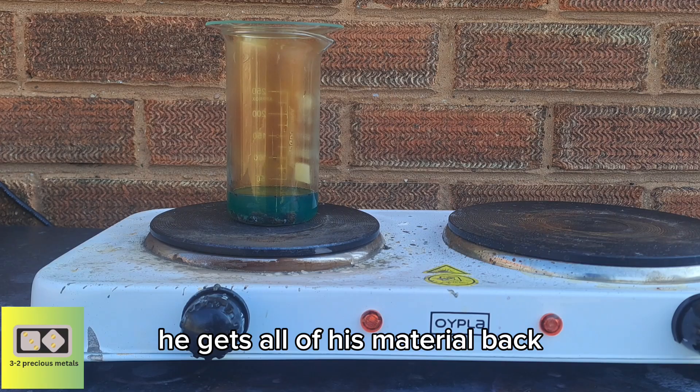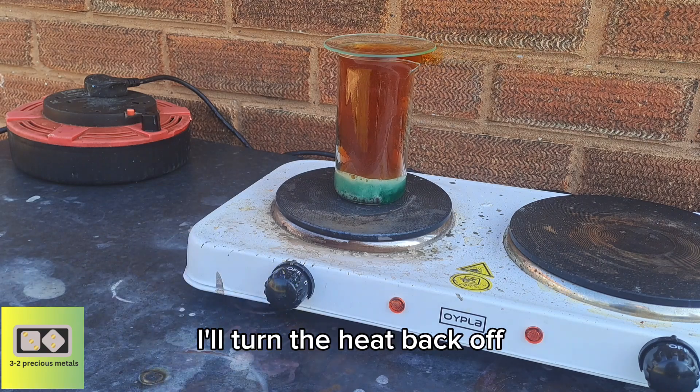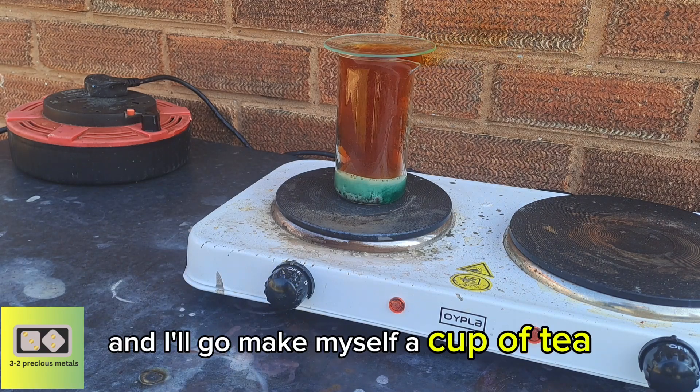He gets all of his material back. A couple of minutes in, with a little tiny bit of heat, the reaction's really taking off. So I've turned the heat back off and we'll just leave it to react. I'll go and make myself a cup of tea.